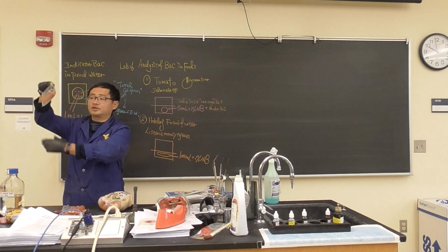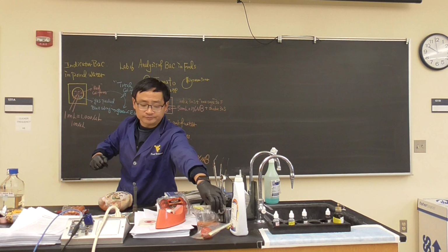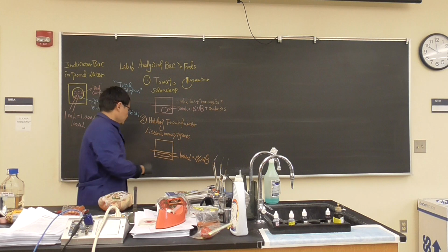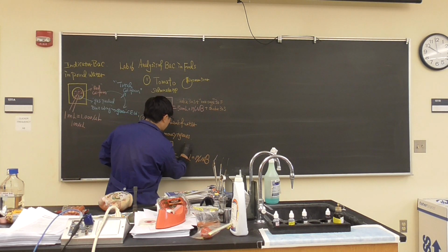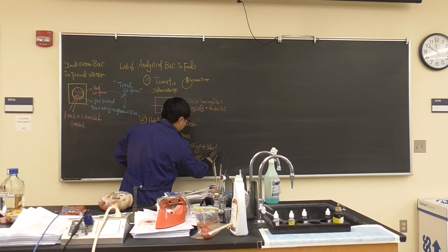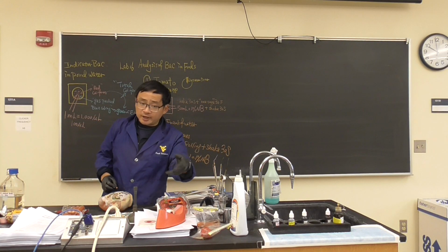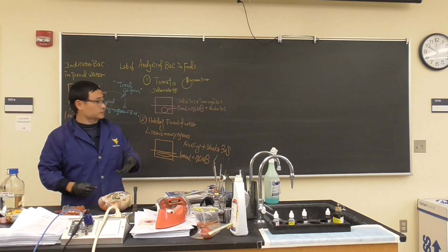The air gap in the middle lets you do a shake. So this method is rolling plus shake, 30 seconds. Remember, what we are preparing is a sample, a solution.